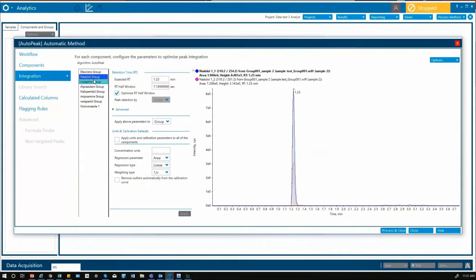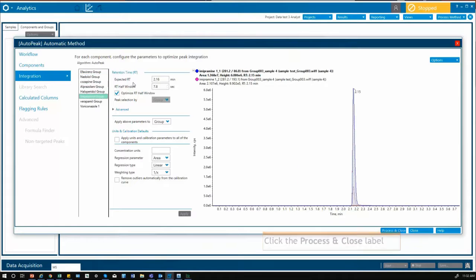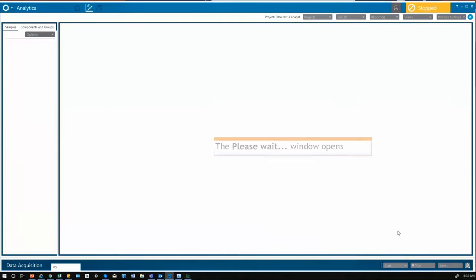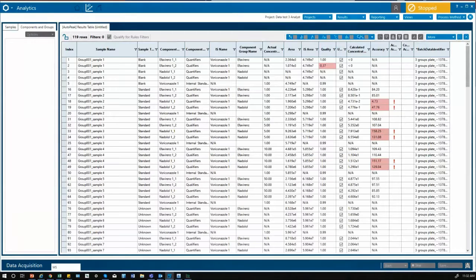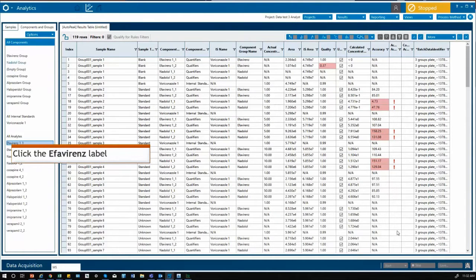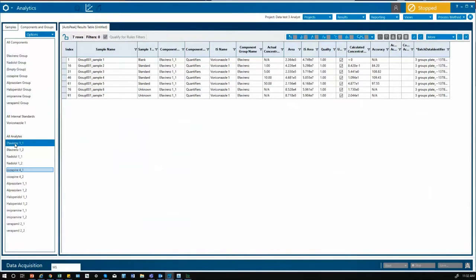At this stage you can add calculated columns or flagging rules if you require. Now you go to process and the results page will appear.